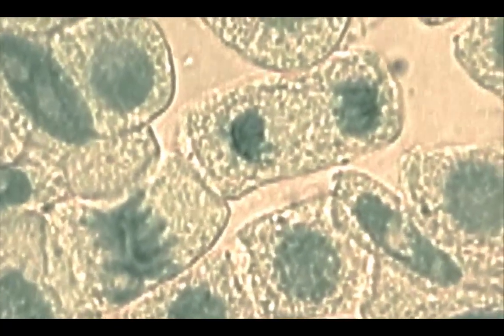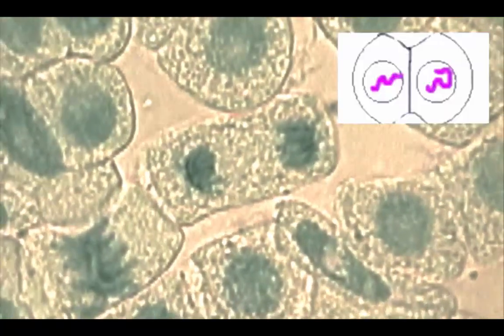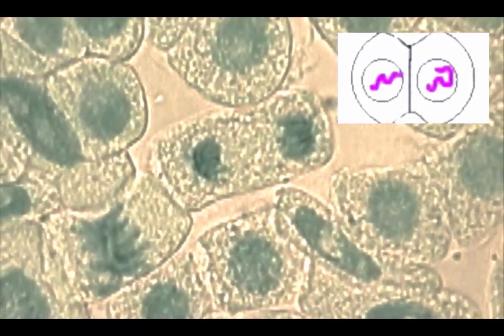This cell here is in telophase, where the chromosomes are uncoiled and the nuclear membrane is beginning to reform around them. Cytokinesis can take place after this.